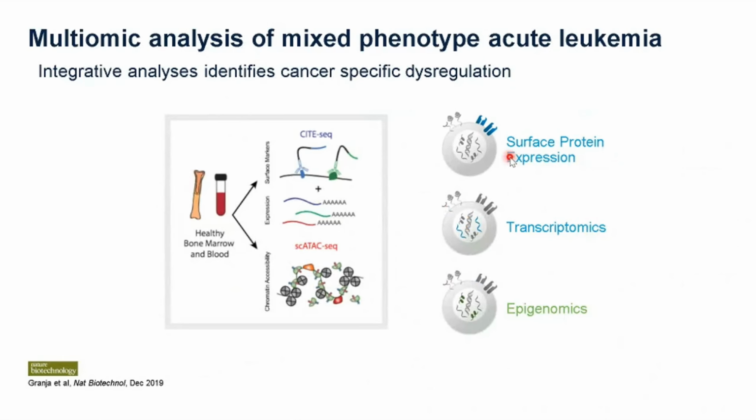Here we are combining three pieces of information: the epigenetic information by using ATAC, the sequencing of the gene expression profile, as well as the protein labeling of the cell surface protein, where we sequence the feature barcode. Then we can compare the cell surface marker, gene expression profile, as well as the epigenetic information in a single set of sequencing data.